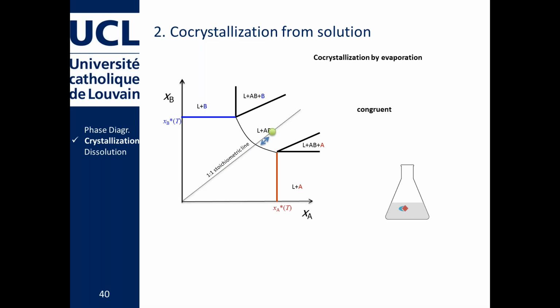What I showed you now is a spontaneous crystallization of my co-crystal. Either you seed or you hope it crystallizes. I recommend seeding. Then, of course, if you continue evaporating, you can continue crystallizing out co-crystal. I put the green dot a little further. The green dot represents the overall composition now, so it becomes more and more concentrated. Of course, your solution concentration is given by your solubility line, so you get more and more solid out.